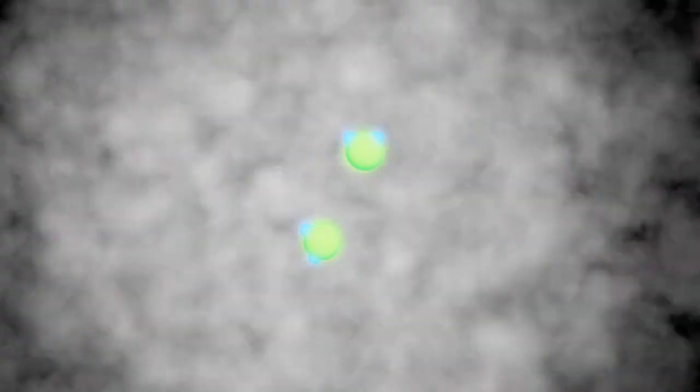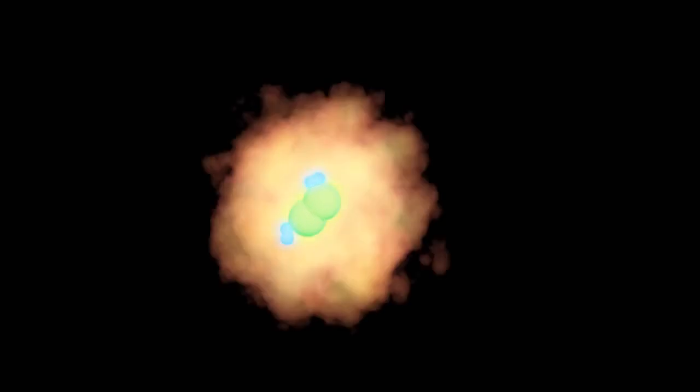Hydrogen is highly flammable, so it is quite easy to check if these bubbles are actually filled with the right stuff. These small explosions that you saw were basically hydrogen reacting with oxygen. In that process, both gases combine and water is violently recreated.